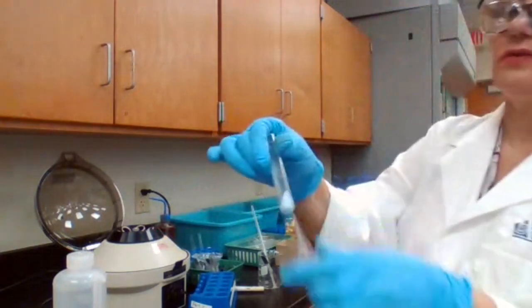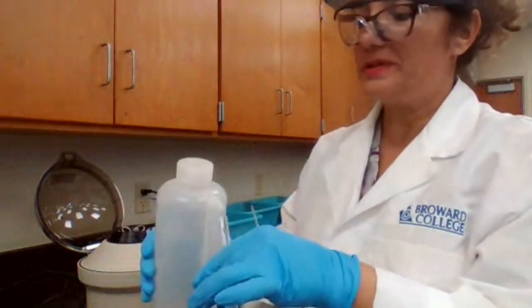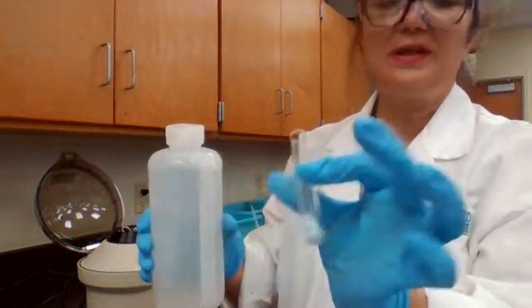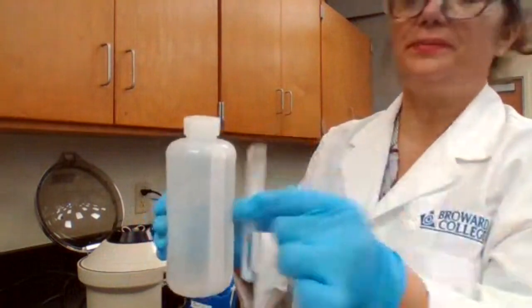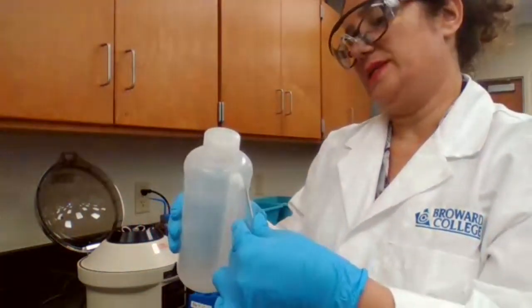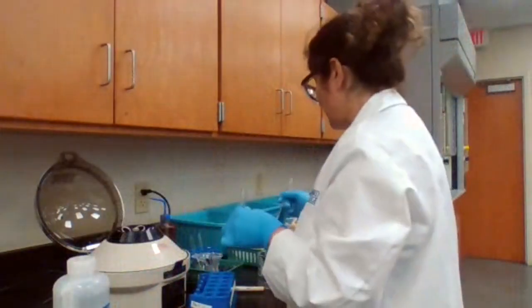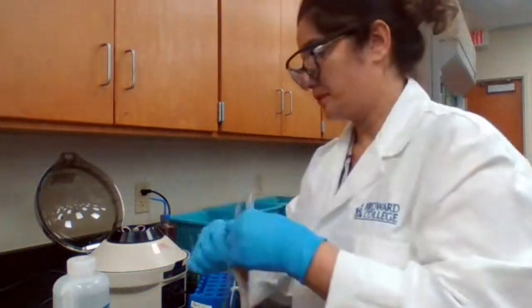We have this white precipitate that is bismuth, but to confirm it, it appears light blue. Why does it appear light blue instead of white? Because it needs one more washing. We try to get all the copper out.